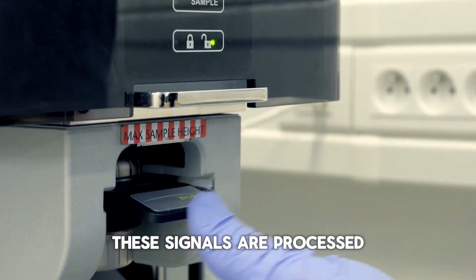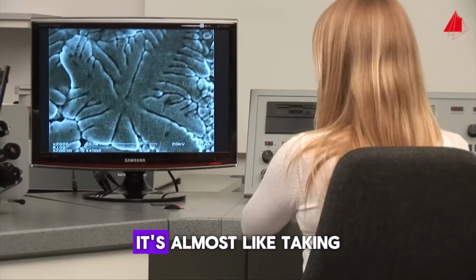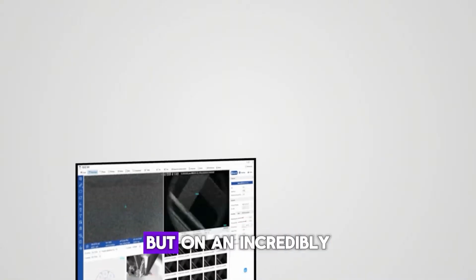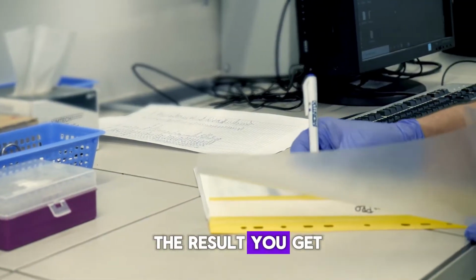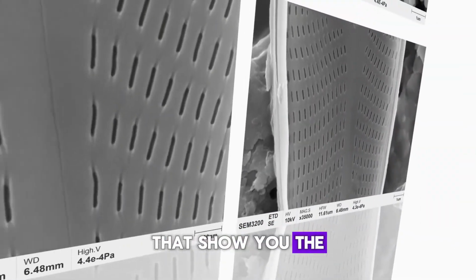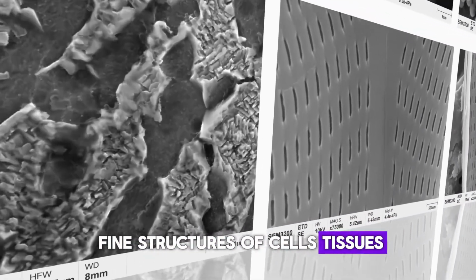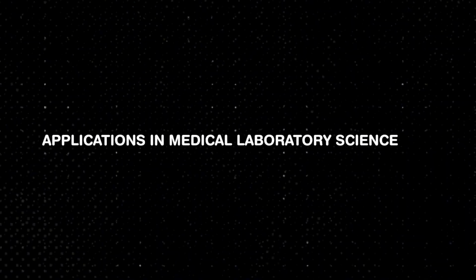These signals are processed to produce a detailed image of the sample. It's almost like taking a photograph, but on an incredibly tiny scale. The result? You get extremely high-resolution, 3D-like images that show you the fine structures of cells, tissues, bacteria, and other tiny specimens.